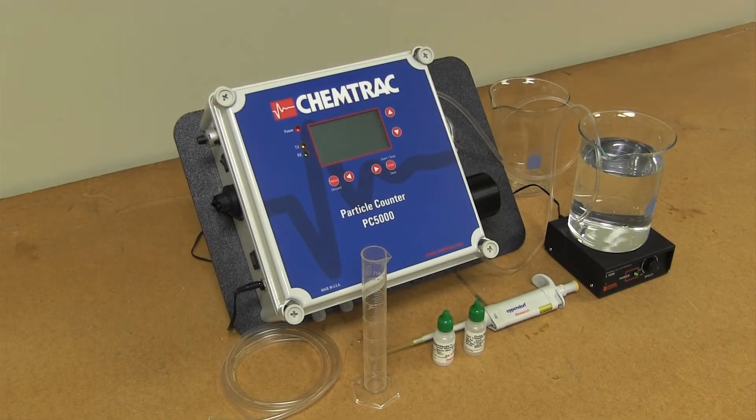When using the PC5000 in the lab, it is necessary to have a beaker with a magnetic stirrer, a second beaker or drain for the disposed sample flow, a graduated cylinder for pump calibration, and particle standards to calibrate the analyzer.